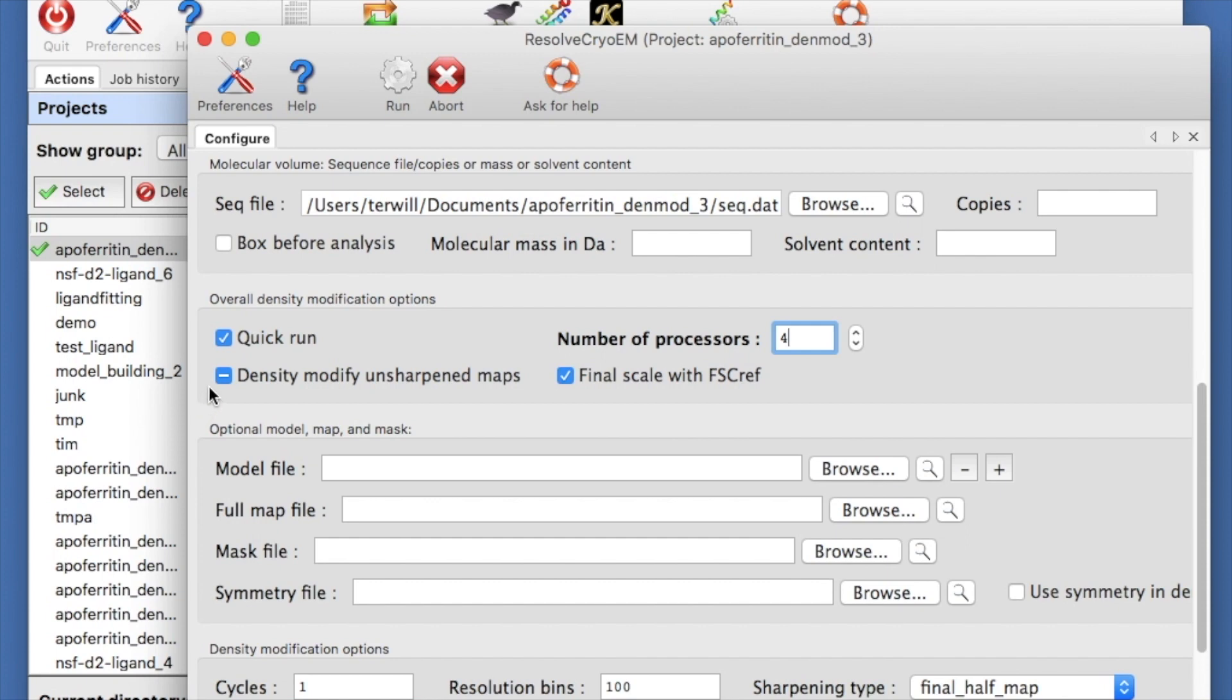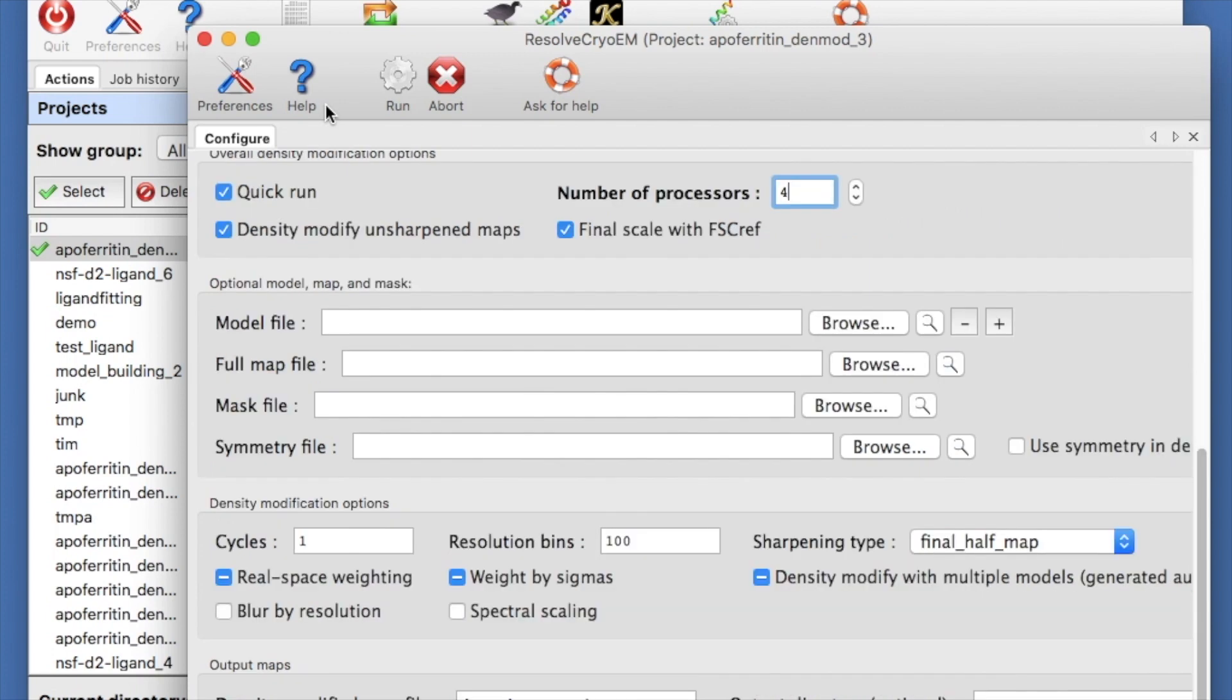And let's density modify unsharpened maps. This sometimes helps for high resolution maps. The alternative is to use maps with half map sharpening applied. We're ready to go. Hit Run to start density modification.